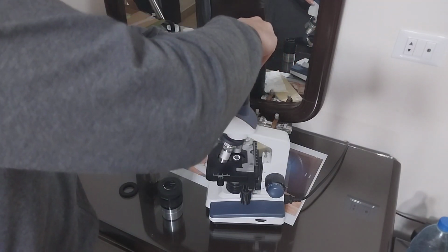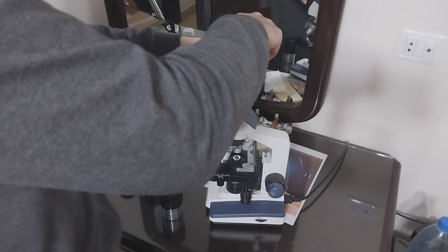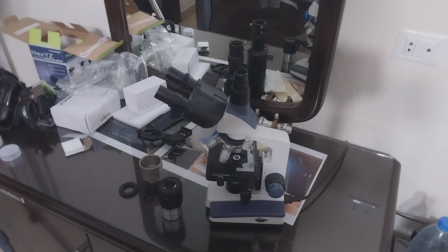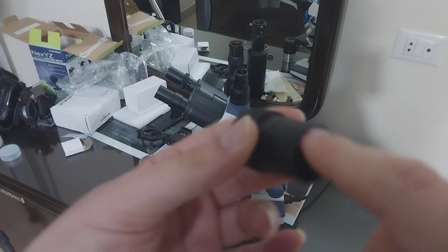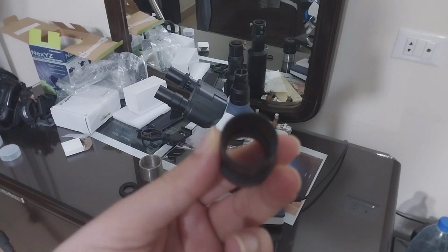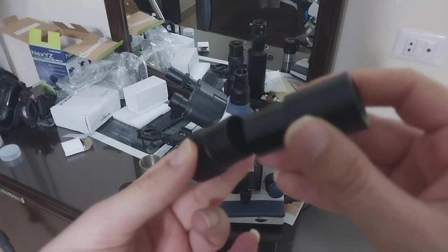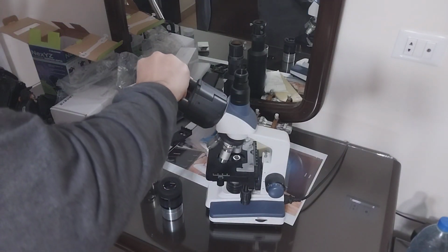See, we have to uninstall it because we're going to use it as an example of the methods on how to install eyepieces in general. So this is for a telescope, and this is for a microscope eyepiece. The hole here from inside is 23.2 millimeters, which is for these eyepieces. So this is the eyepiece of a microscope that goes like this. The same can go here like that.